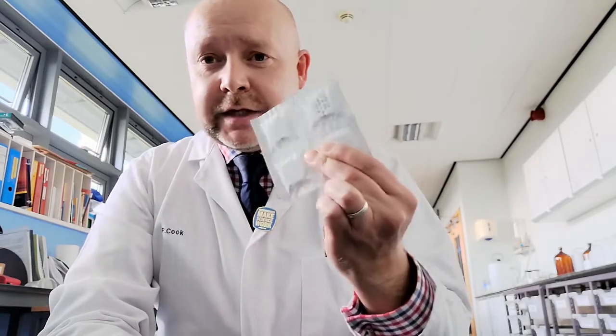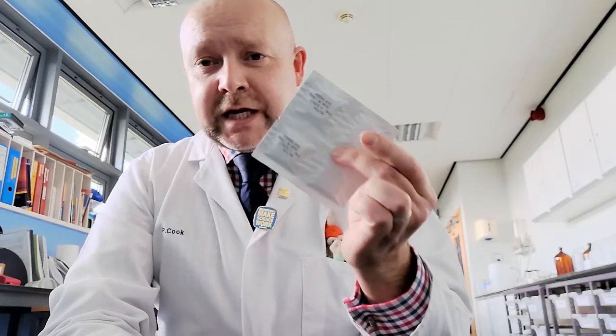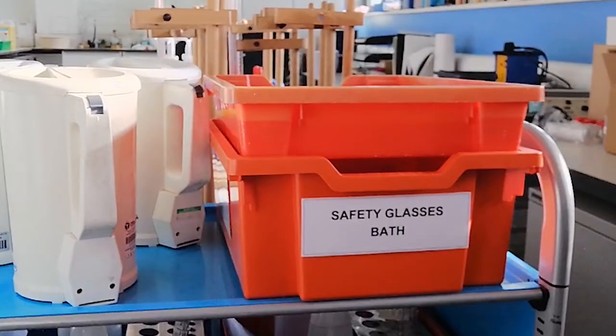Something else that technicians will be well used to seeing probably is these — Milton tablets. If we're going to use any safety glasses, we have to put them into a bath of sterilizing solution, and as always, gratinels are perfect for coming up with a solution that we can use as technicians.